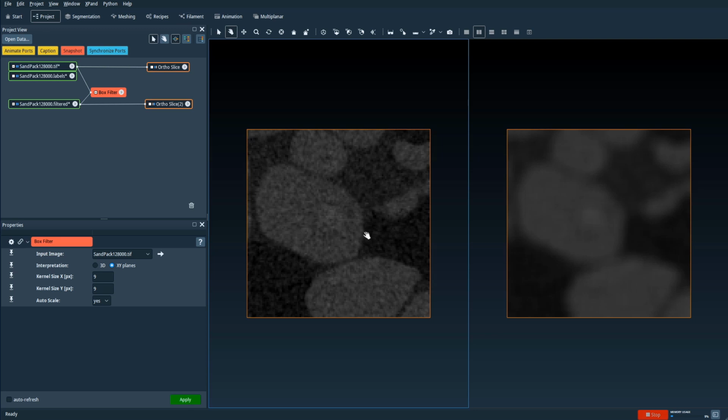And yeah, this usually takes some trial and error, and getting familiar with the filters, what they do, what the parameters do. And at some point you get a good intuition of what these filters do, so you can better decide what filter to use with your data sets.